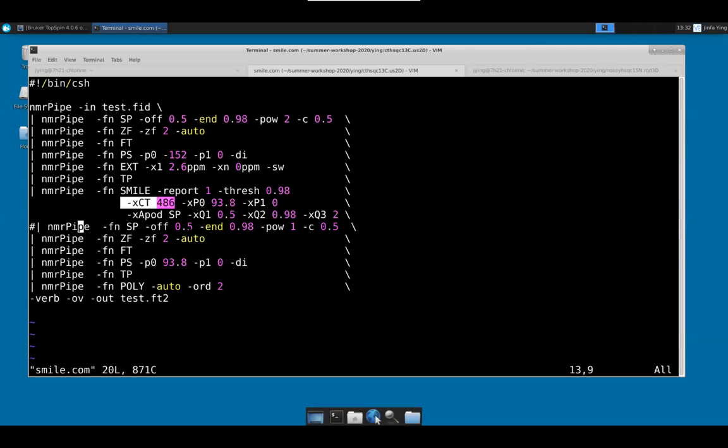Yeah, I was asking the question following up from the first point scaling. So you just briefly mentioned the first point scaling, how it relates to the linear phase, right? Yes. Yes. So can you please repeat it, so I can take a note? So I look at the linear phase. If it's 0, plus or minus 45, I use 0.5. If it's 180 plus or minus 45, I use 1. And if it's 360 plus or minus 45, I use 1. Any other value, I don't remember anymore.